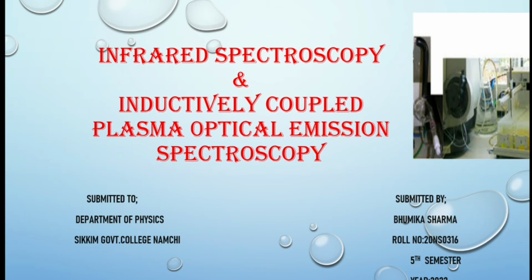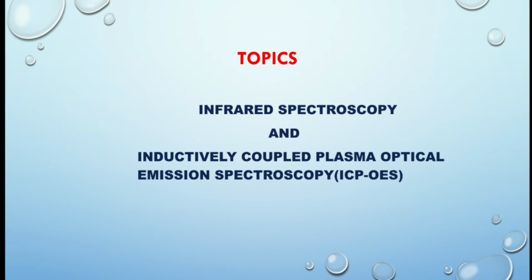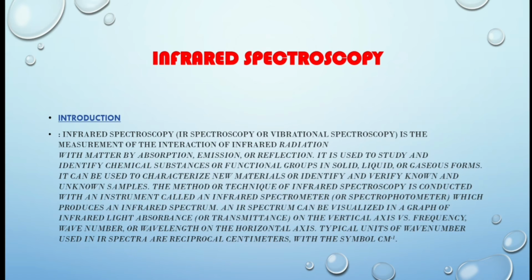So, moving forward with the presentation, here are the topics I'm going to talk about in this video: infrared spectroscopy and inductively coupled plasma optical emission spectroscopy, ICPOES. Here is the introduction of infrared spectroscopy, IR.